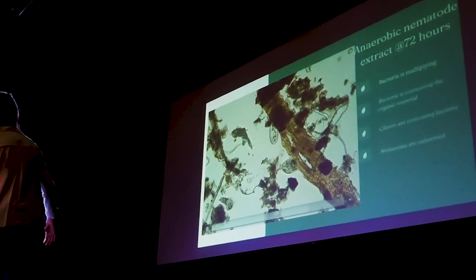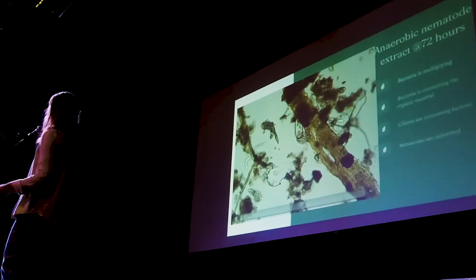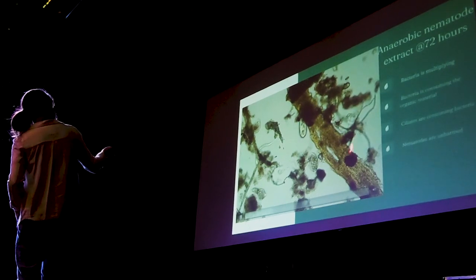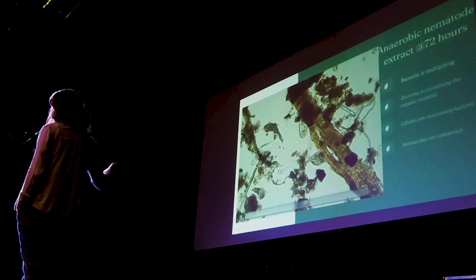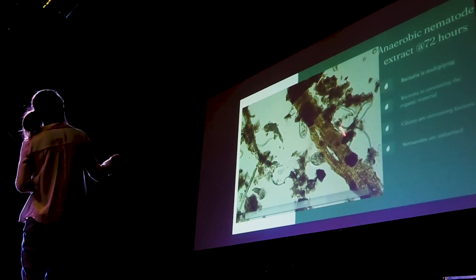And so you can see in the video, there's some aerobic organisms around, but it's mostly the ciliates. And we are seeing some diversity of ciliates here. You can see a stellate trichome. Let me see, where is that? Right there. That's a part of a plant that protects it, so things don't want to eat it. You could think comfrey, that spiky material on the leaf would look like this under the microscope.